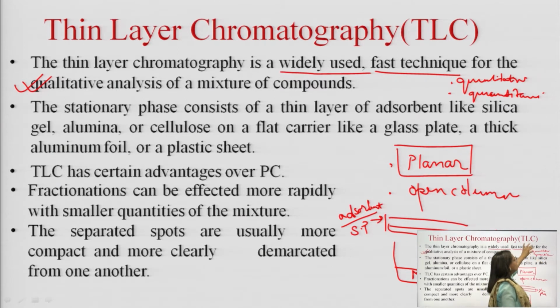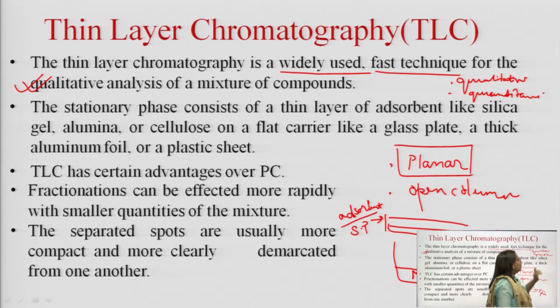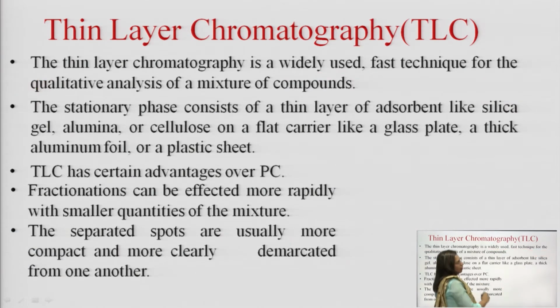Qualitative means identification of something, and in quantitative we generally go for the methods wherein estimation of the amount with which these solutes are present is calculated. So, thin layer chromatography is a very basic technique and it is mainly used presently for qualitative analysis purposes.